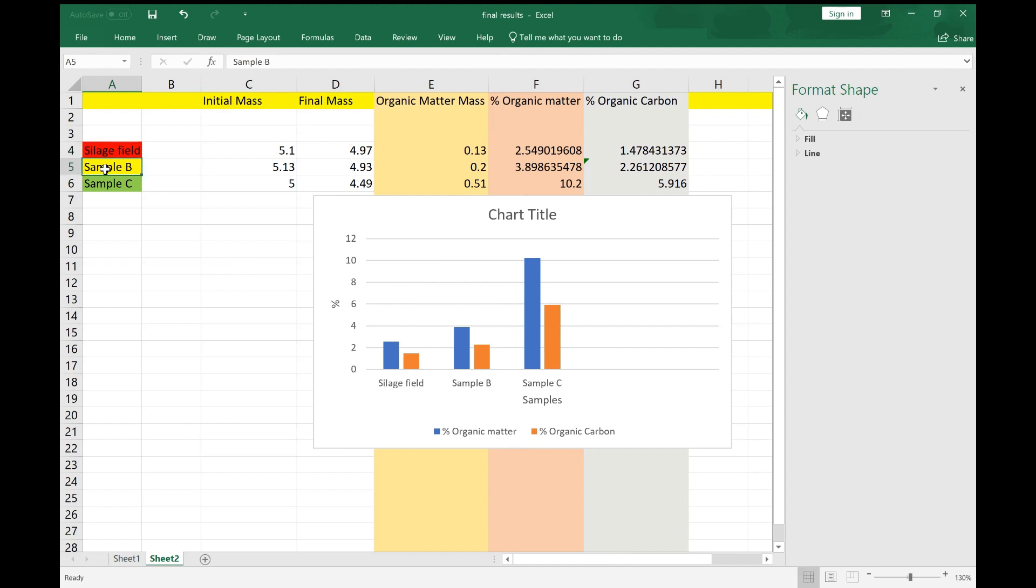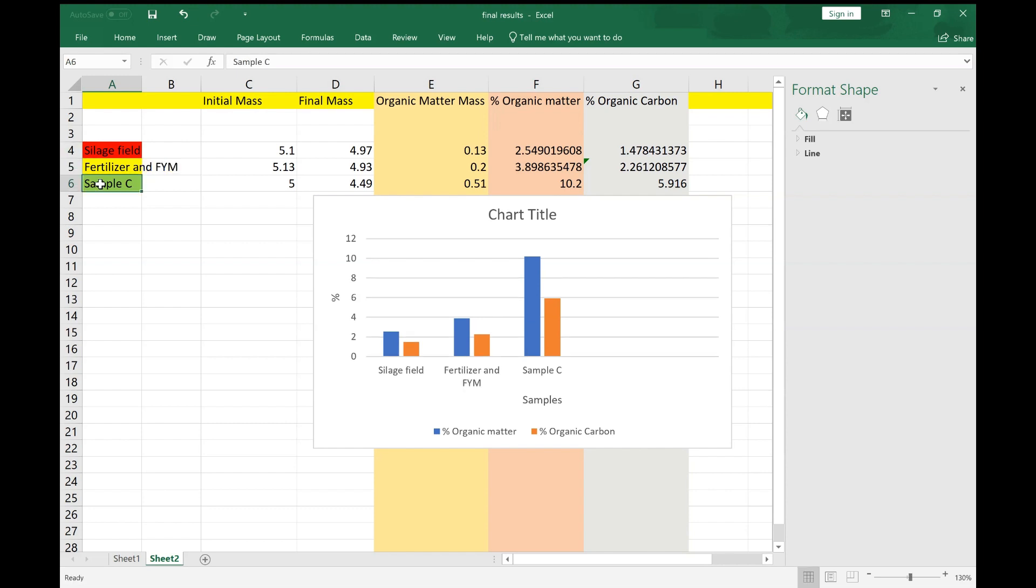Hit enter, and that changes that. Sample B then is fertilizer and farm yard manure, and sample C is just farm yard manure. And then I can have my label of samples on the bottom, and then I could have chart title: the percentage organic matter and percentage organic carbon.